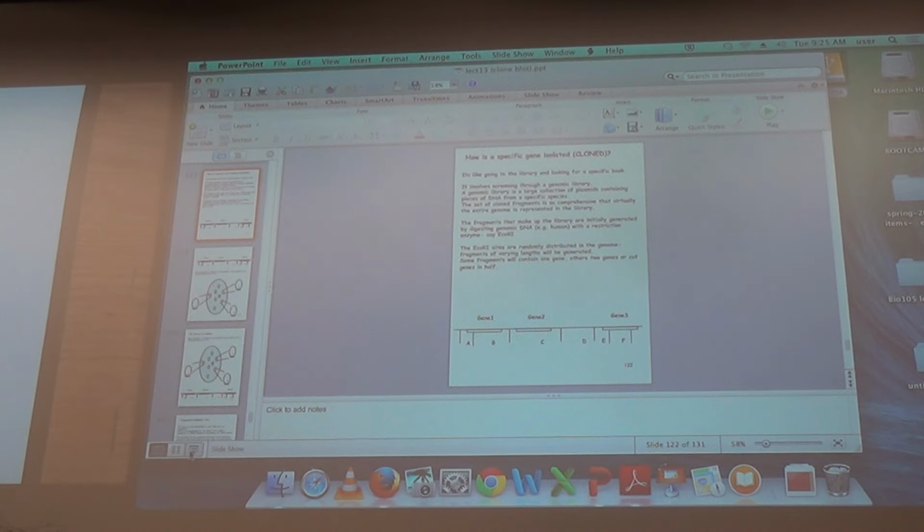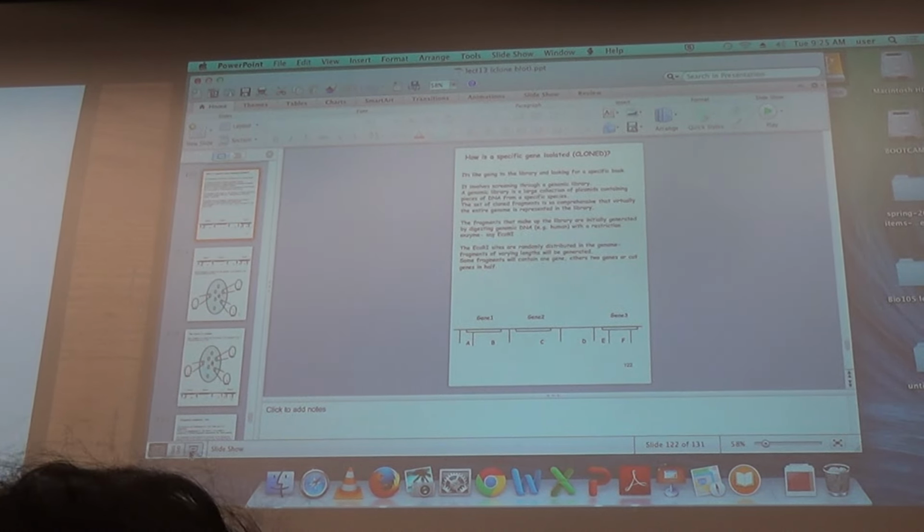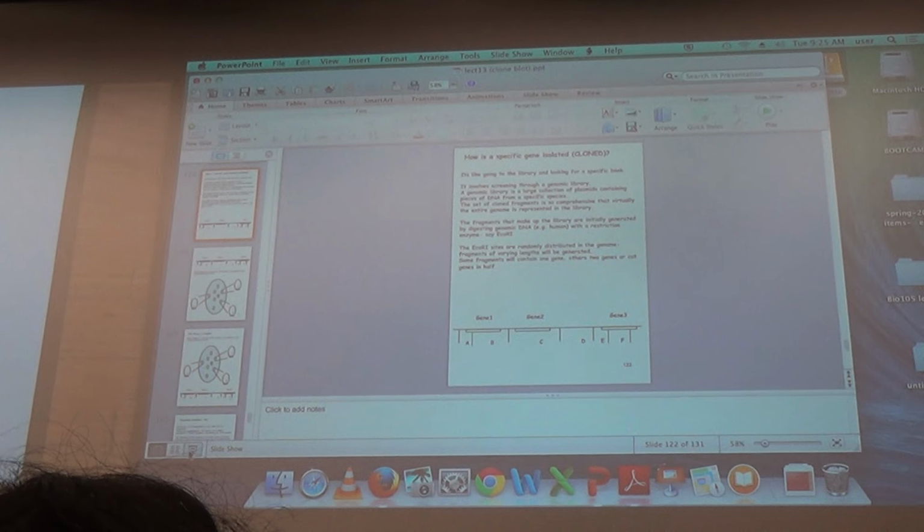Question? Yes, how long does it take for this hybridization? Overnight. And then the next day you have a result. So 2 days at the most, if you're a little slow to do this. Obviously you have to get it to work over and over. But these days there are companies that do this for you. You send them the RNA, they will do the analysis for you. They'll do all that contract labeling. They've become so good at it that it's very easy to get information.